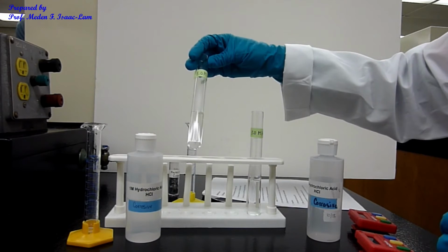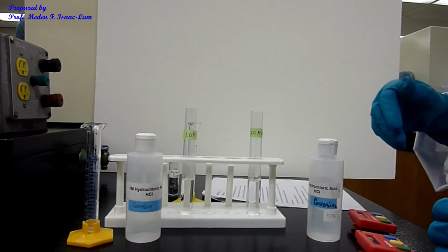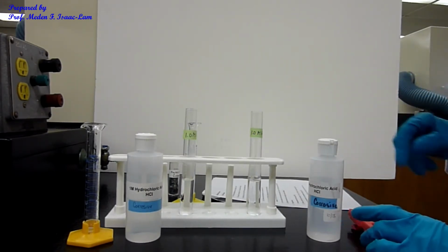So this one is almost done, and then it's going to stop bubbling. So the reaction was done in 1 minute and 45 seconds.